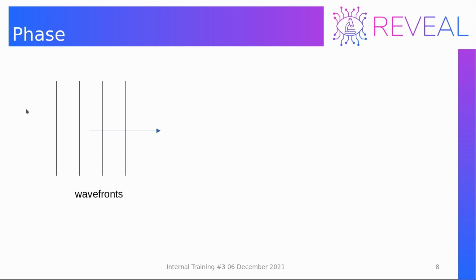When you see optical microscopy pictures, you will notice that we usually don't draw these sine waves, we only leave the wavefronts. It makes it easier to talk about the light beam. In that case, this wavefront is called a plane wave, because this wavefront is planar.